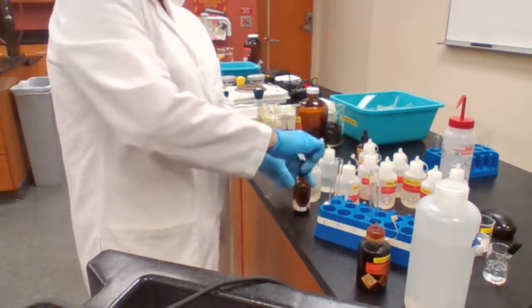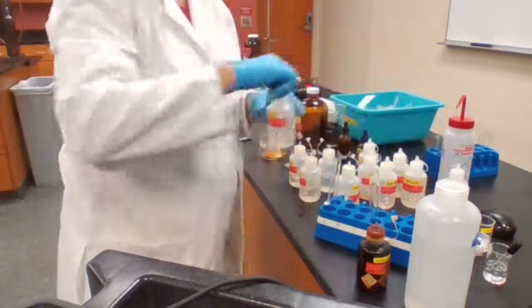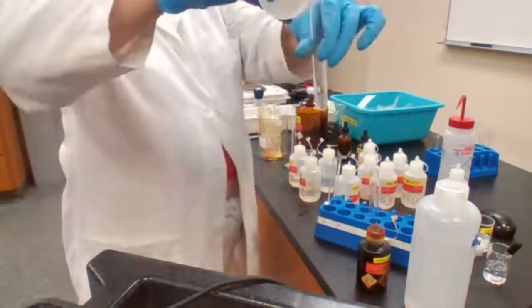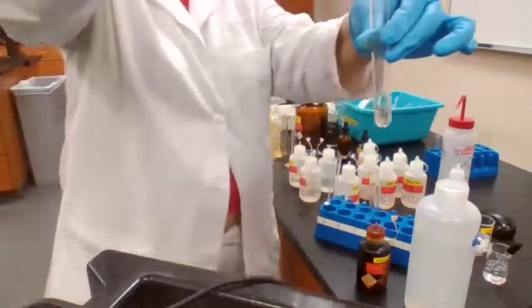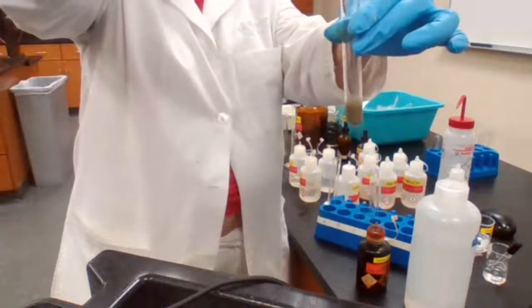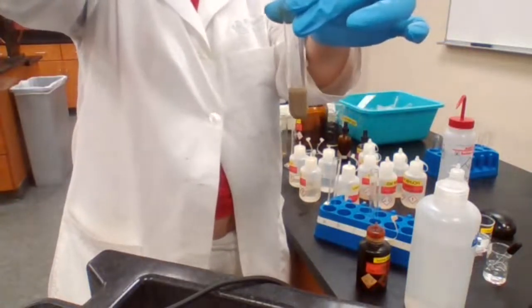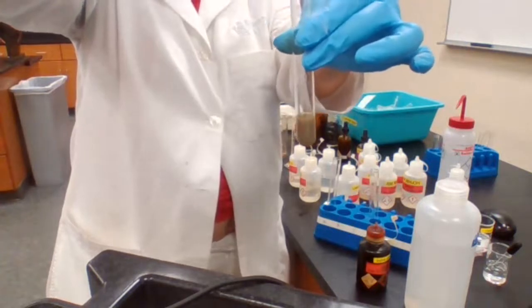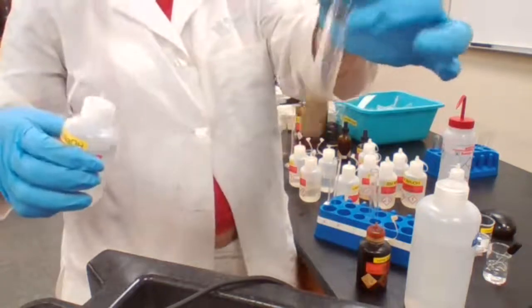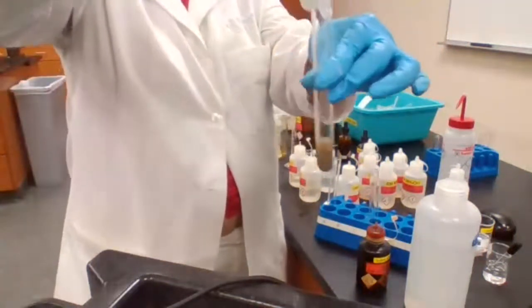I have my silver nitrate, and we are adding sodium hydroxide. When I add sodium hydroxide to the silver nitrate, it's going to turn black and form a precipitate. It's forming silver oxide, or silver hydroxide rather, and is a dark brown color.